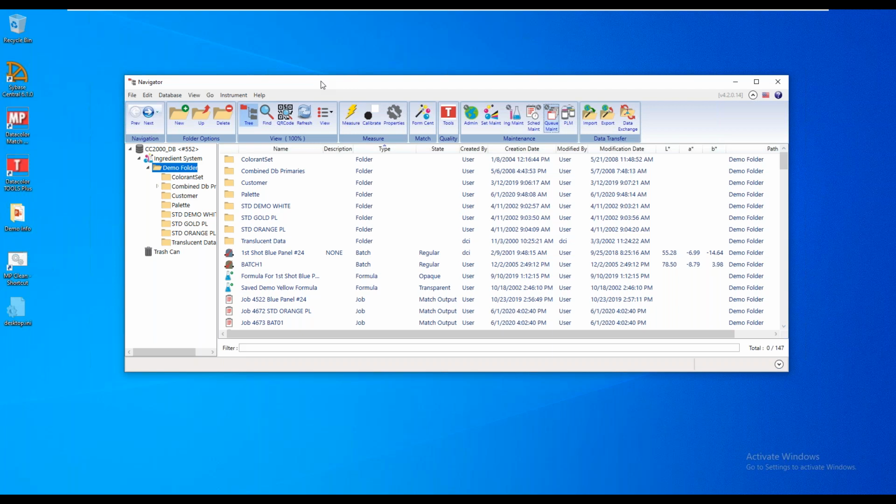So what we're talking about today in Match Pigment has to do with volume matching. An example of this would be in the architectural paint business, where color labs have palettes of colors that could be anywhere from 1,000 to 2,000 different colors that they have to match with a variety of different products that they have in order to provide validated formulas to the paint stores that will be dispensing those formulas into paint cans.